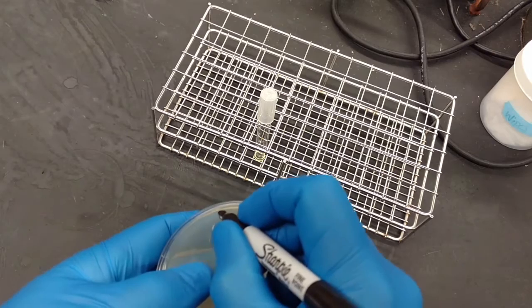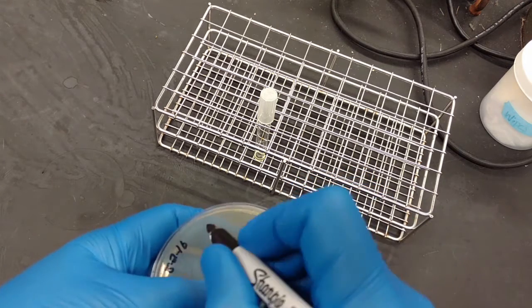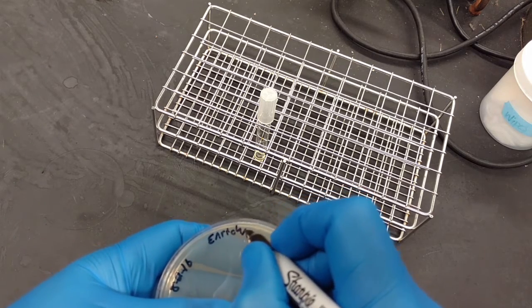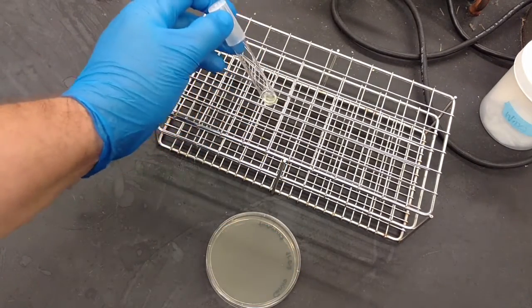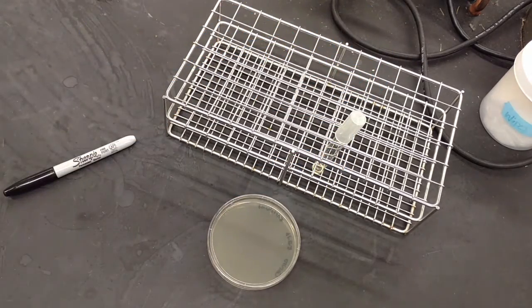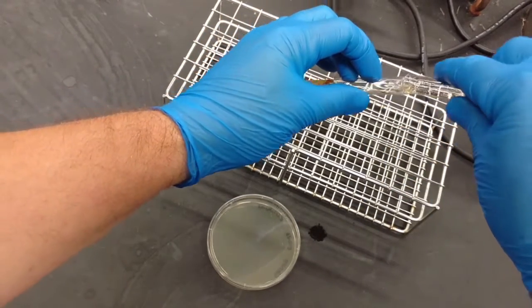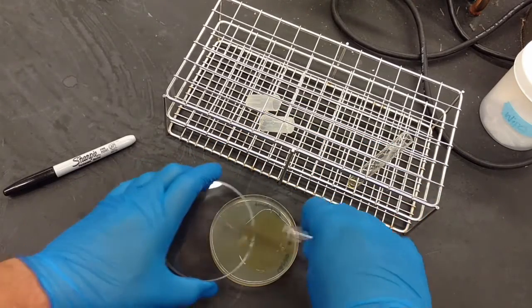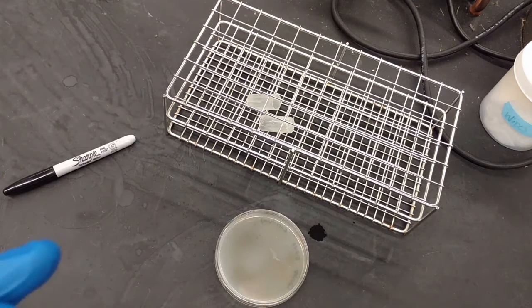Take the plate, go ahead and label it with the name, date, and what the sample is. We're making a top agar lawn of cells, so we've got our cells and we need some top agar. Add the top agar into the cells, put the cells onto the plate, make sure it's covered nicely with no air pockets, and let it set. By the time the enrichment is done, the plate will be solid and ready.